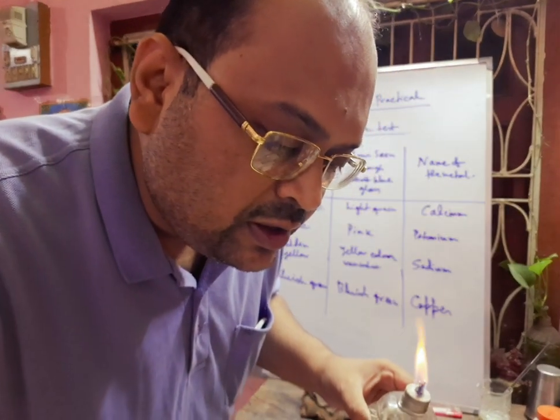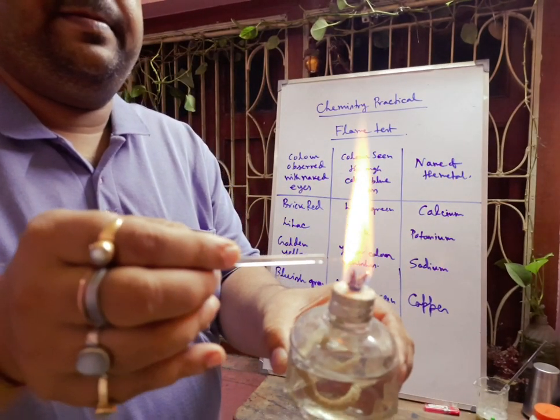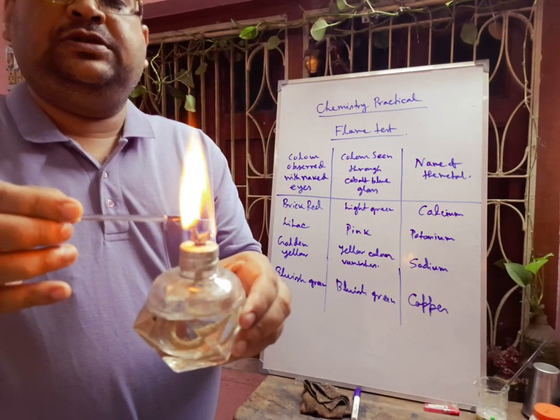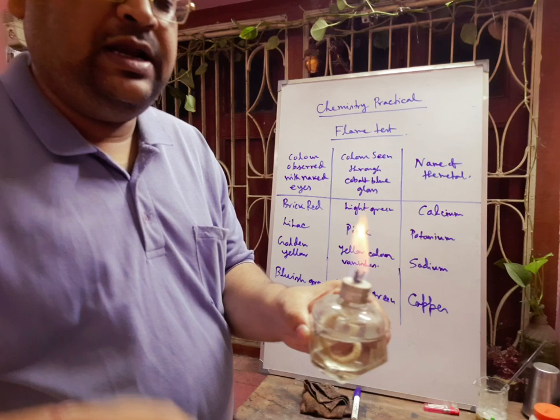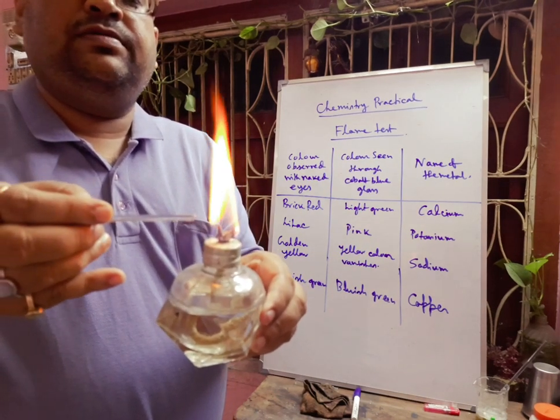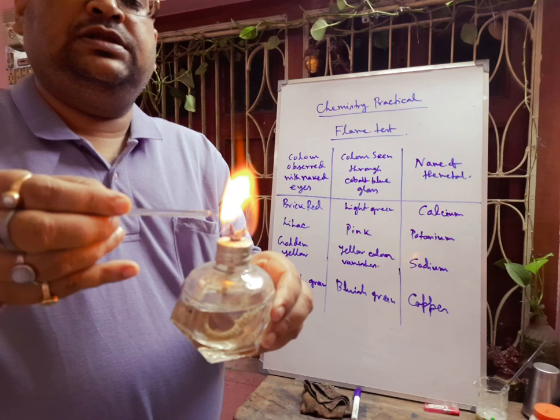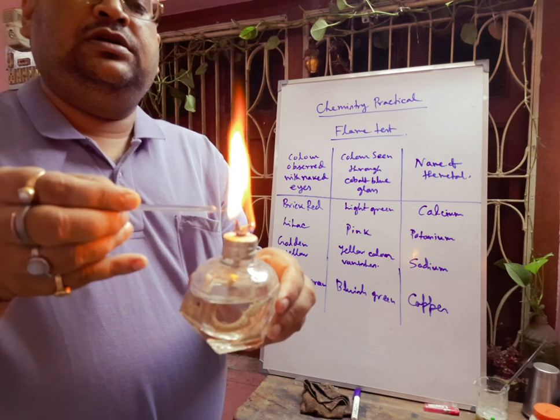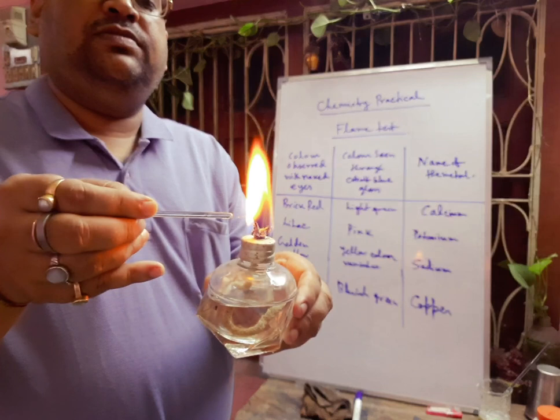Now you can see the golden yellow color appearing. This indicates sodium is present. This golden yellow color is due to the Na⁺ ion. If you check it through double blue cobalt glass, this yellow color will be absorbed and it will vanish.